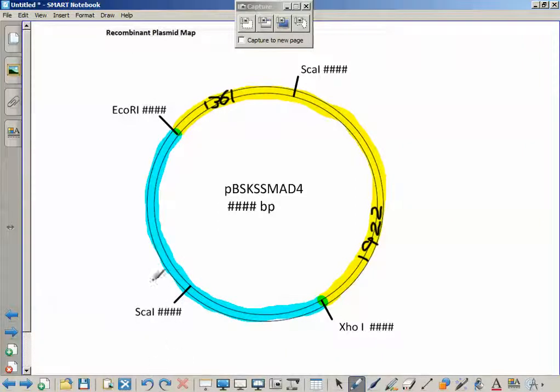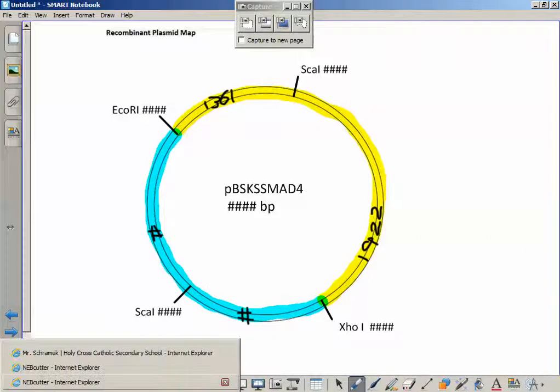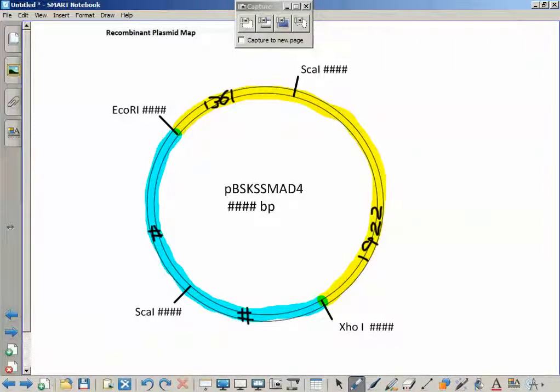This is just the number sign, right? So whatever the value is for that fragment in there, and whatever the value is for that fragment in there, you'll have to figure this out yourselves. I've already shown you how to do the first one. And that's that. Then the next piece is to do your custom digests, and then you're going to provide a proof for the location of the start and stop codon using amino acid sequences. That's a whole other thing; I'll queue up a different video for that. So this is for mapping.